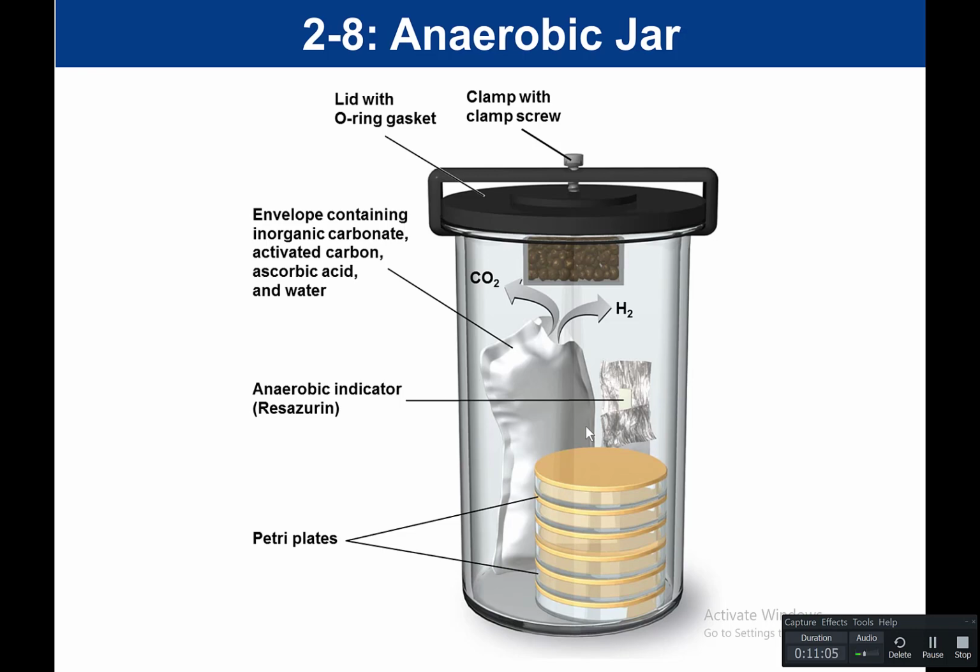So for each of our organisms, we grew them aerobically in the incubator and anaerobically in the anaerobic jar. And so we want to see, where does bacteria grow? Does it grow only aerobically? Does it grow only anaerobically? Or does it grow under both conditions?